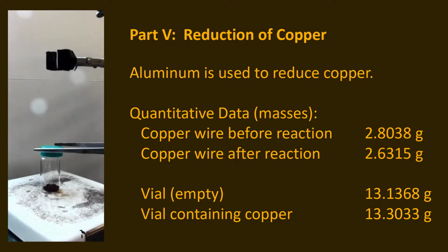But we're relying on the fact that for at least a moment, this doesn't have anything in it except for solvent vapor. And that's going to protect our metal from oxygen.